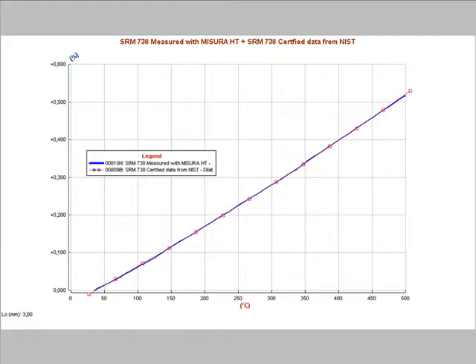The measurement is carried out with no contact on both sides of the sample, and for this reason it is an absolute measurement.